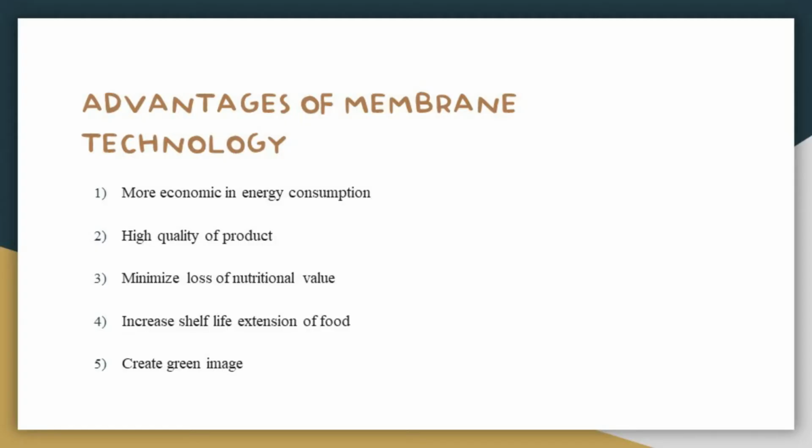Okay, now I'm going to explain about the advantages of membrane technology. The first one is that it is more economical in energy consumption. The second one is it can produce high quality products.